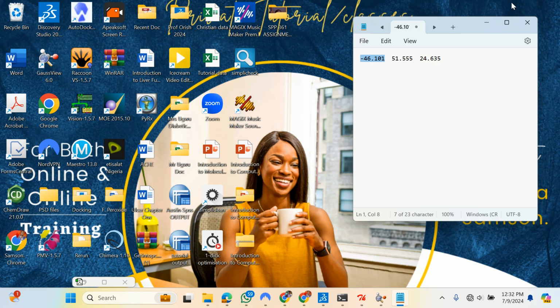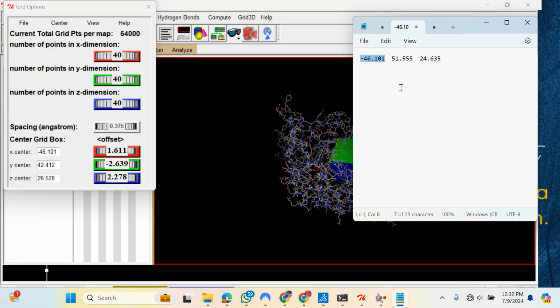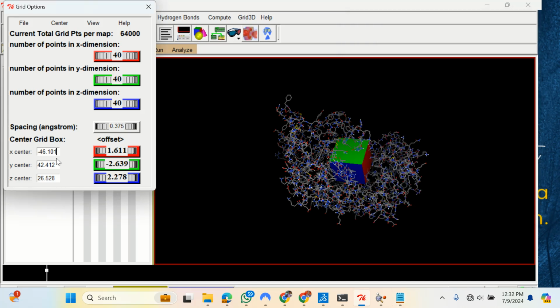Yeah, I just need to do this. So what do I do? I'll copy this and then go to that two. Okay, you will notice what is happening as I paste this. I'll paste this first one, right? Then I'll click outside, go back to the notepad and pick this as well, right? I'll copy it and then I'll come here and paste it. Do you notice anything there?